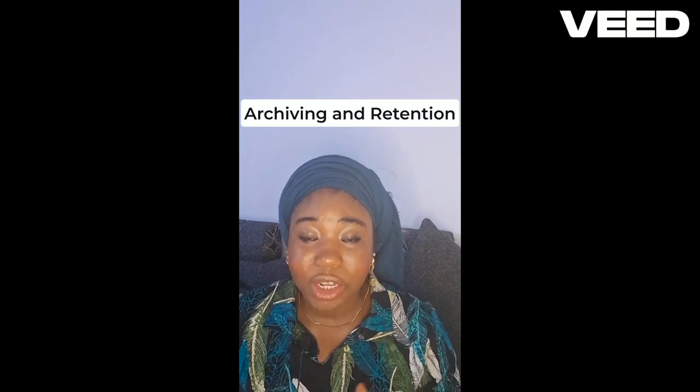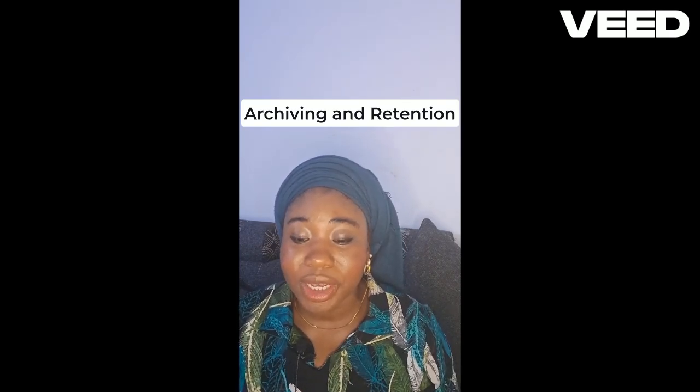Also, we have archiving and retention. Archiving and retention in good laboratory practices mandate the archiving and retention of all study related documentation and materials for a specific period of time, typically several years, until they are needed, when they will be brought out for the purpose of their use.